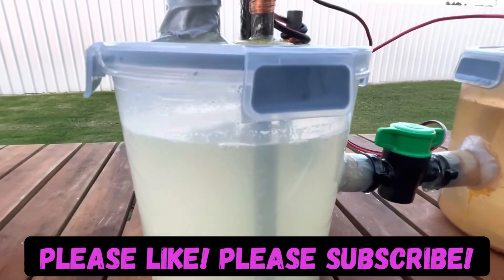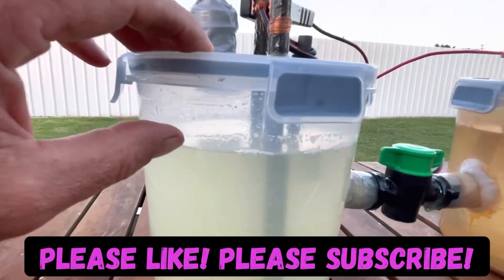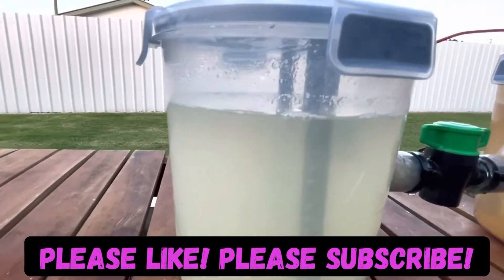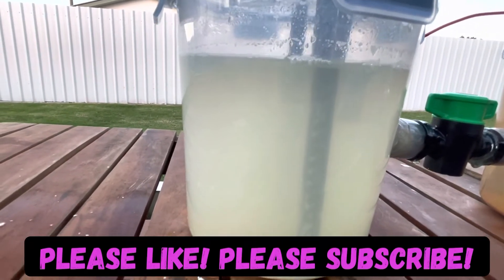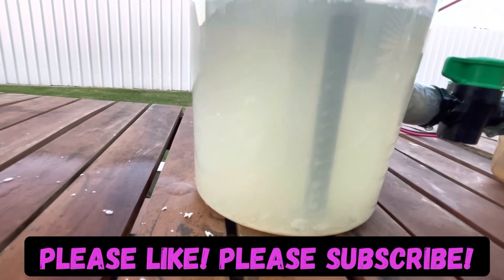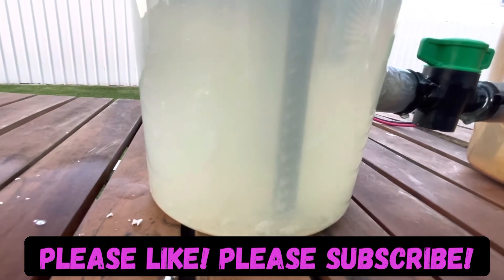It must also be said that with the cup I pulled out of each side — one from the sodium hydroxide side and one from the iron chloride side — I did process that, putting it through the air still. I reduced it down into a solid form and then attempted to mix it with oil to see if there was an exothermic reaction. I mixed it with water first and there was no exothermic reaction.